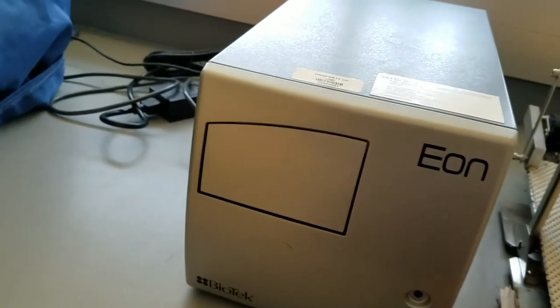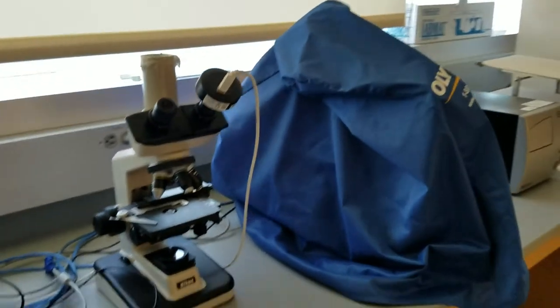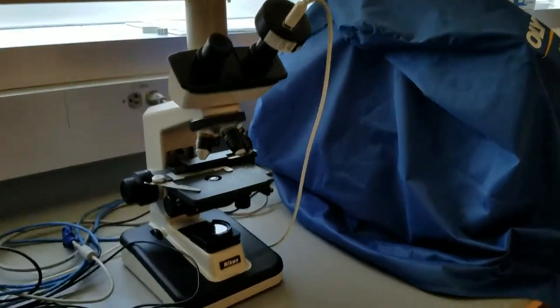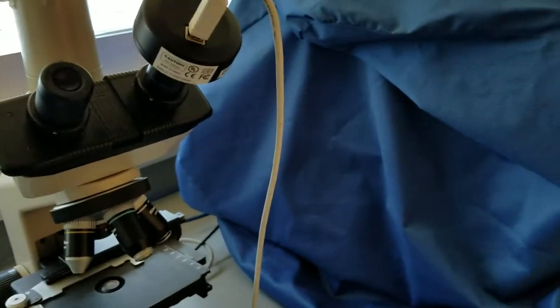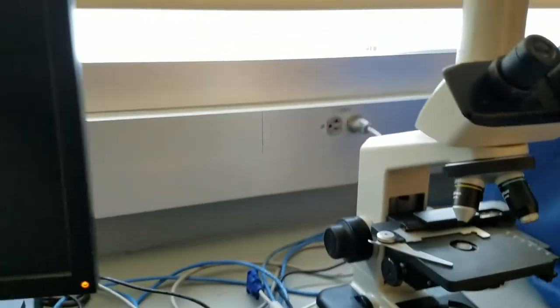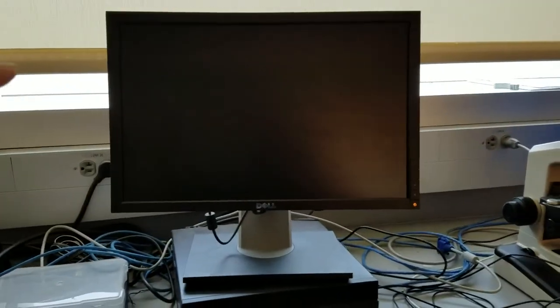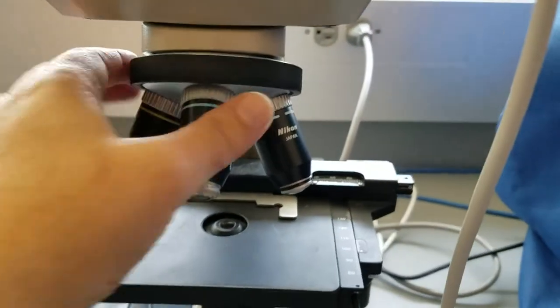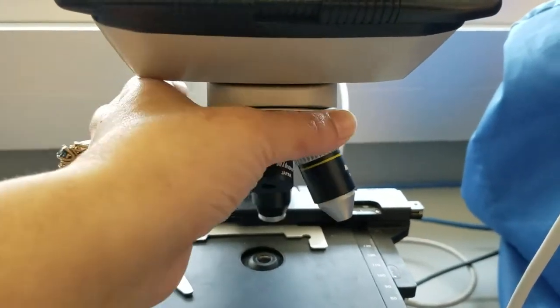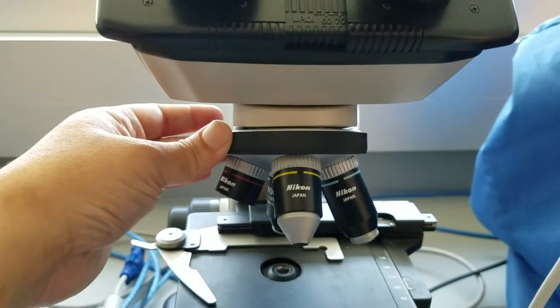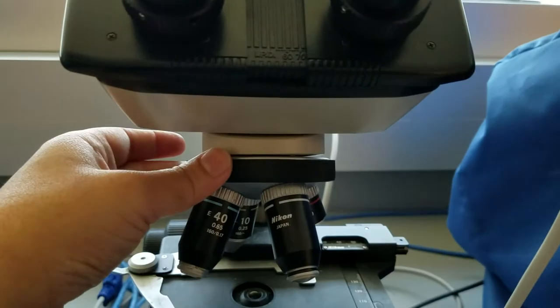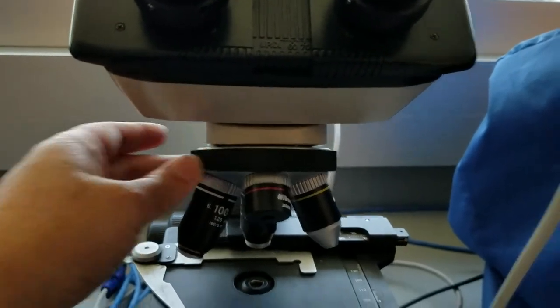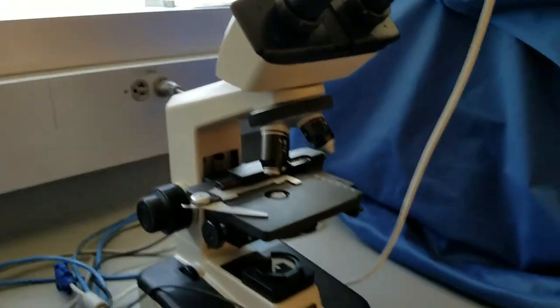Here we have another one of our inverted microscopes, and then right next to it I have normal compound microscopes like the ones that you are probably used to. These microscopes are binoculars. They have a camera attached to it so that I can also look at the images and show them to you as well as you can look at them yourselves from the computer. It has our nose piece that has the various objective lenses - they go from the 4x scanning objective lens to the 10x, 40x, and then finally 100x which is the oil immersion lens. So we can look at objects all the way up to a thousand X magnification using this particular microscope.